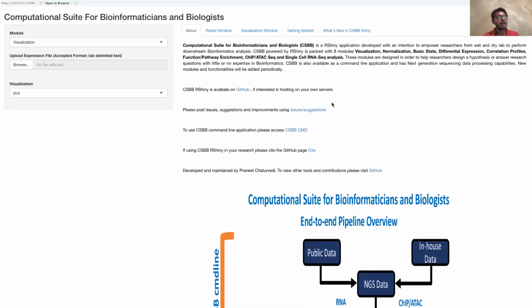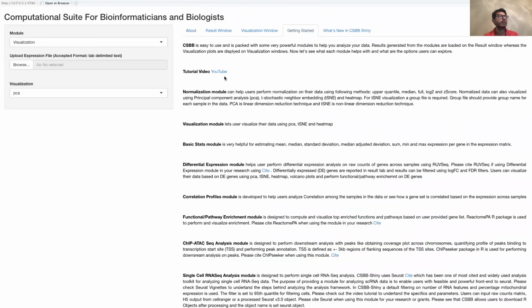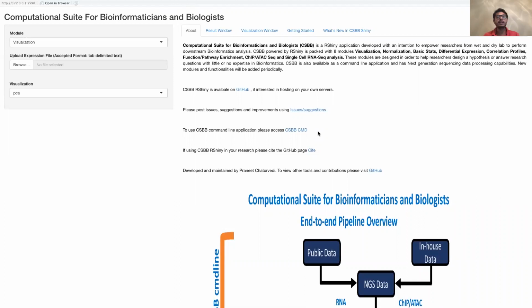Just in case you have not seen a tutorial before, there is a video tutorial on YouTube, which you can watch to learn how to use the other modules apart from the single cell. Today, in this tutorial, I will be covering how to use the single cell module.